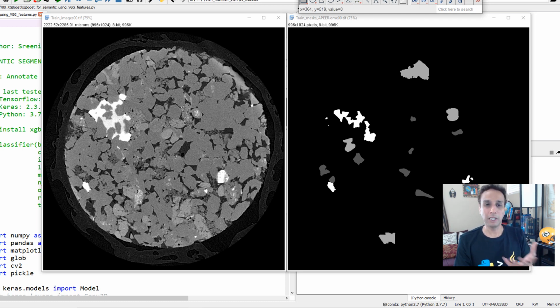Okay, so what is a label? Label is ground truth. So in this ground truth, my dark pixels have a value of 0. And something else has a value of 1, like this one has a value of 2, for example, this grayish region. So my goal is to segment these different looking regions, okay? Which is very hard using just histogram segmentation because this one requires a lot of textural information, for example. Okay, so this is my labeled image.